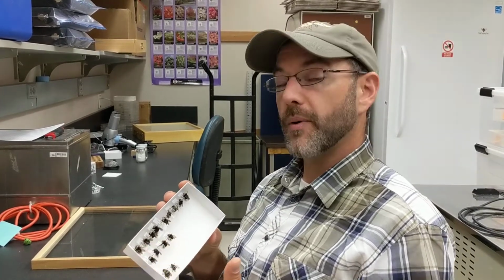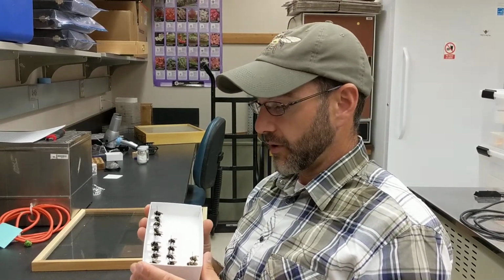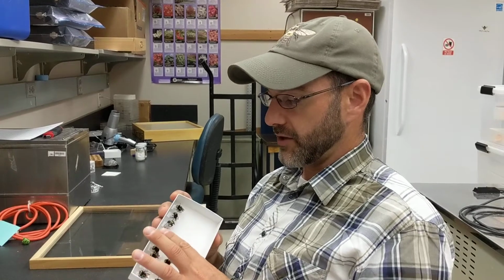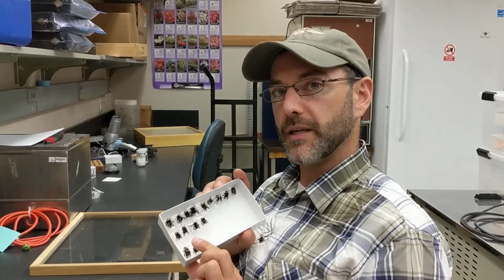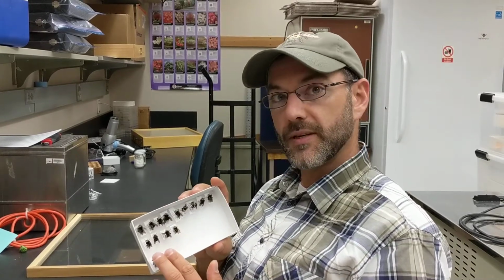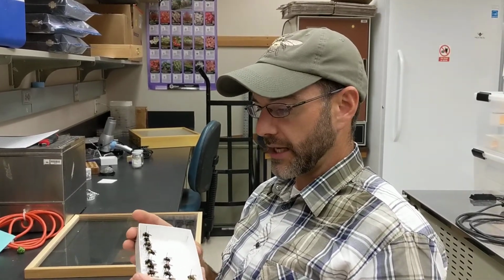So you'd start with your first bumblebee, run it through the key in the field guide, hopefully get the right answer, and then you could run the remainder from that series through to confirm that, yeah, these are all the same things, and then you could apply your name. And then you'd move on to your second group of bumblebees, run those through the key, see if maybe these are the same species or two different species. And so it's a good method to work through your material and try and get names on things.